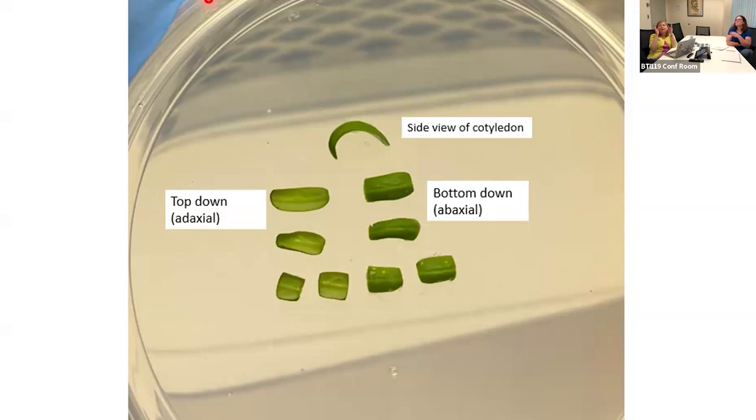We always do side-by-side comparisons with a good sample number before we make any change. When I originally came here, people were using parafilm. I was concerned about how things looked, and when we compared it with micropore tape, we got much better regeneration. So the micropore tape solved both the condensation issue and the regeneration issue.